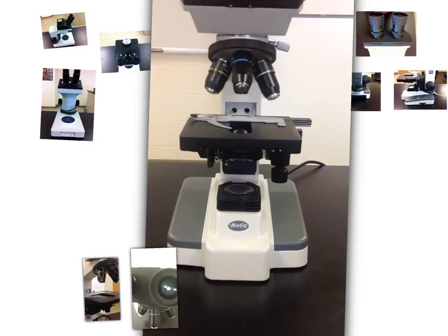Now looking underneath the microscope, we have our condenser, our iris diaphragm. Basically, this is going to let light in. Different amounts of light, so it's almost like the shutter of a camera. So it's going to allow different lights in. Here again, we have our light source.